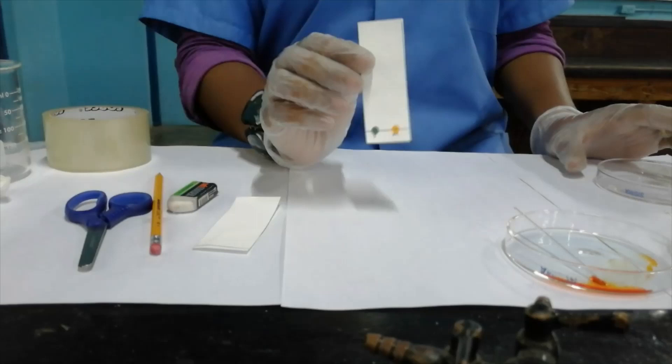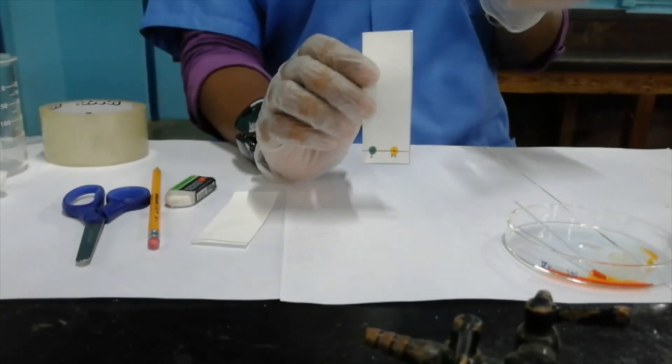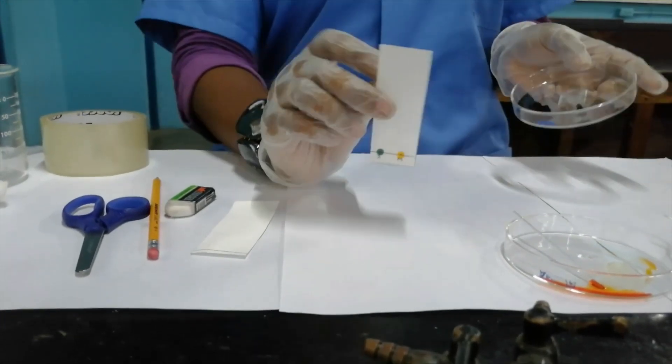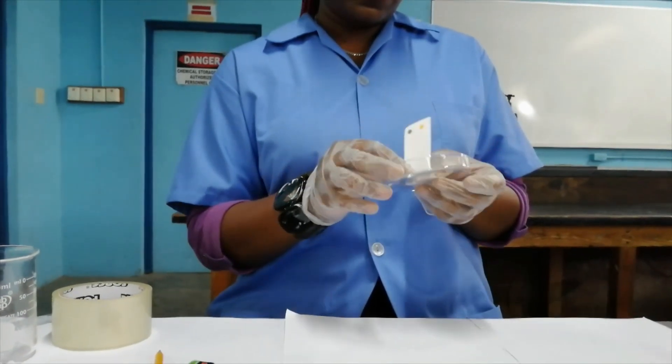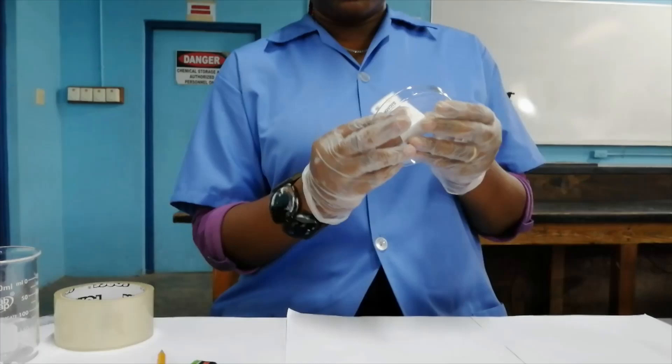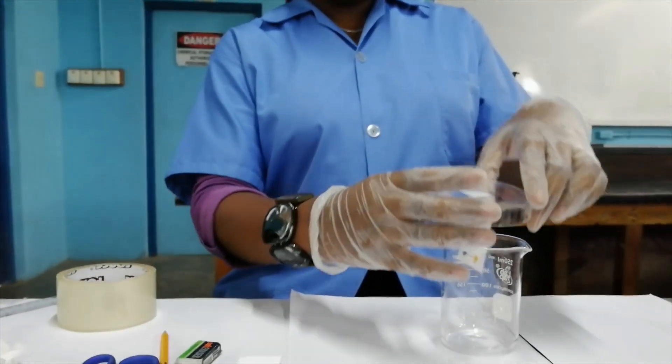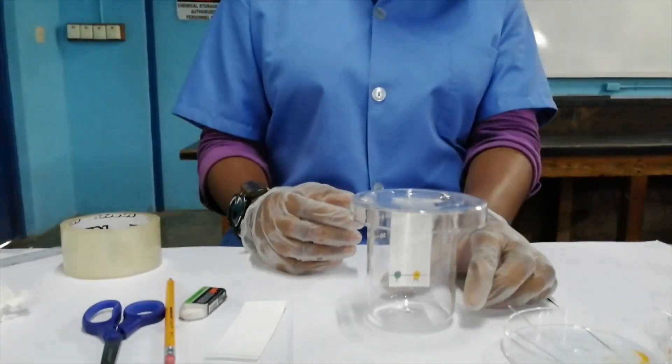I'm now going to attach this chromatograph to the petri dish. I did put a piece of tape there, so I'm going to attach it so that it hangs when I cover the beaker with it. I'm pleased with how it's hanging.